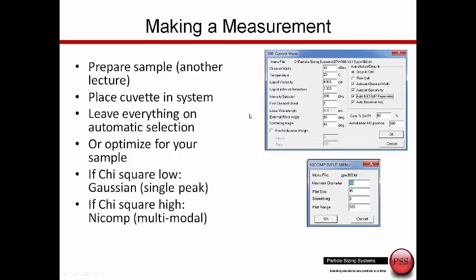Taking a measurement is very easy with the NICOMP. We simply prepare the sample, which is sometimes simple, sometimes a little more complicated. We place the cuvette in the system and looking at the setup screen, we could either leave everything on automatic in terms of baseline NICOMP parameters and choosing the neutral density filter, or we could adjust this for specific applications.